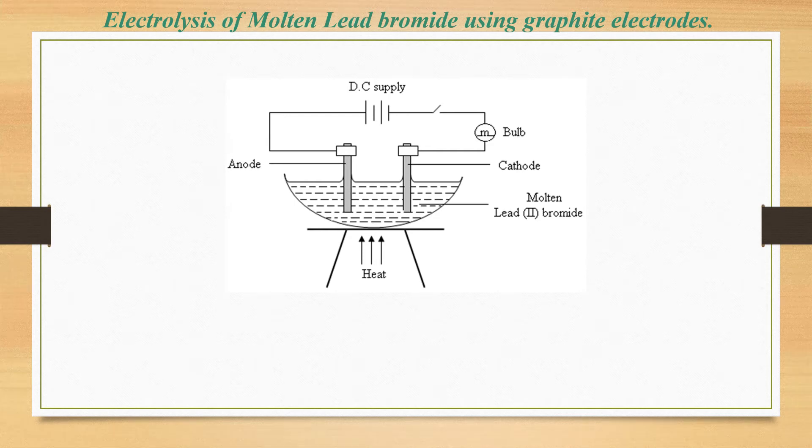In this video, we are going to look at electrolysis of molten lead bromide using graphite electrodes. Remember, we are using graphite because they are relatively inert, so these electrodes won't react with our lead bromide. We shall start with closing the switch. Remember, electrolysis will involve electricity, that's why we have our direct current supply here.